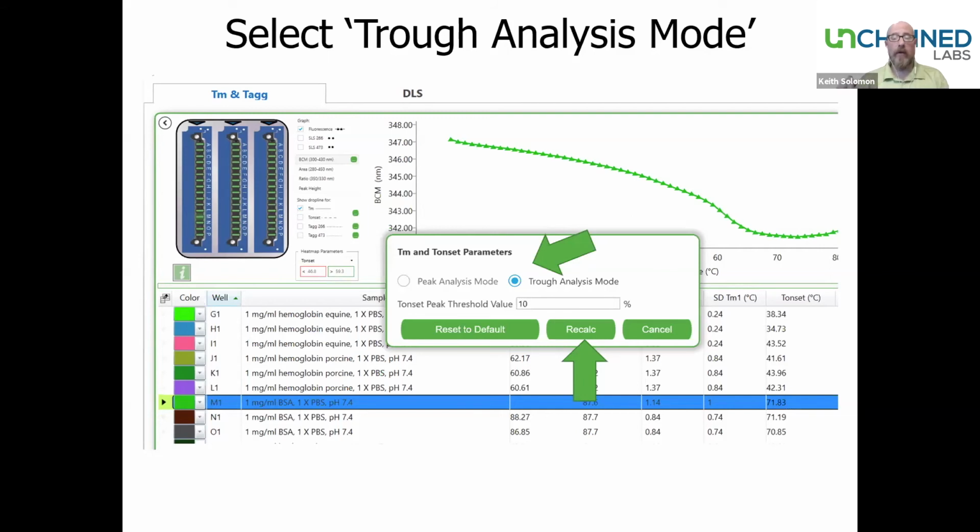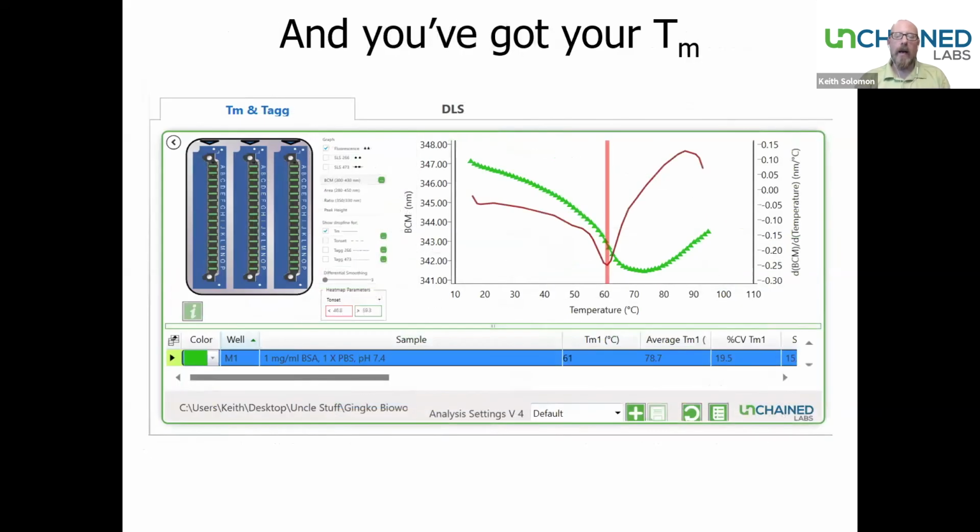And some of those blue shifts you'll be able to see very easily by eye, but some of those blue shifts are much more subtle, and using the analysis tool will bring out blue shifts that you might have missed. Again, you can ask the software to put a TM line. You can do this whether you put the differential equation yourself and put a TM line there, or the software will automatically drop a TM line at the inflection point of the differential equation, and that will report on your TM of your blue shifted proteins.